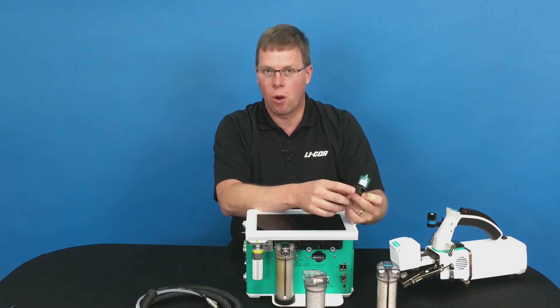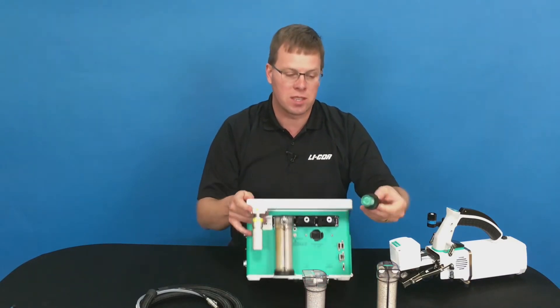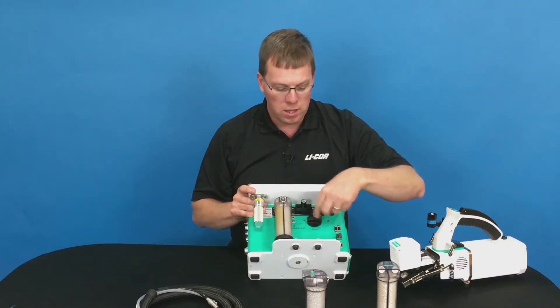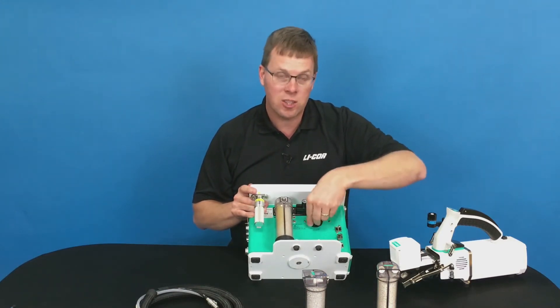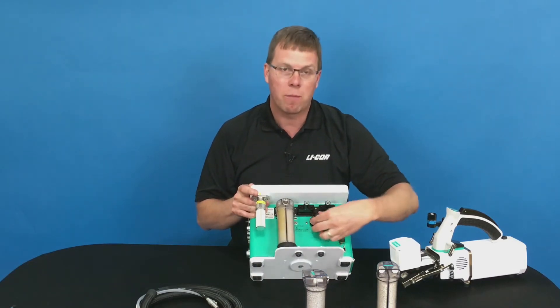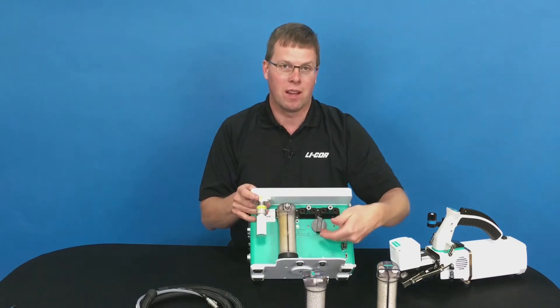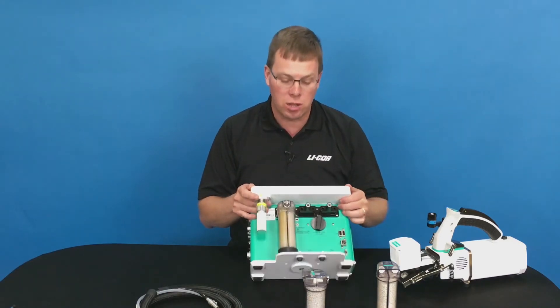Note that there's a little hole at the bottom — that little hole is the air inlet for the system. You want to have that pointed down, so the hole is pointed to the side of the instrument; you turn this a quarter turn and the hole is now pointed down. That way it prevents any water that may be on the system from getting sucked into the instrument.